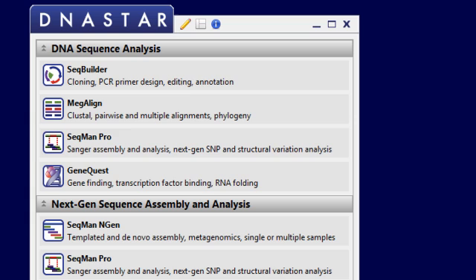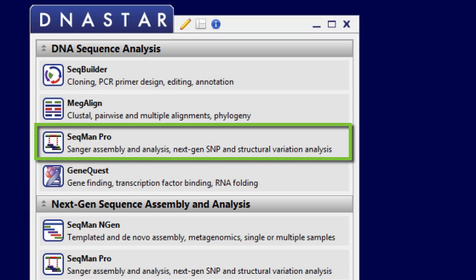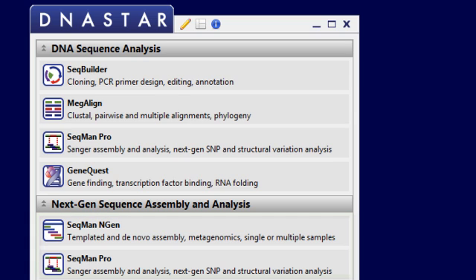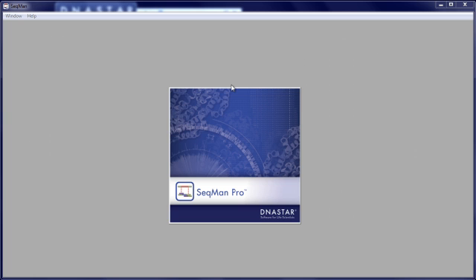SeqMan Pro is DNA Star's application for assembling and analyzing sequencing data. SeqMan Pro can be used to analyze next-gen assemblies from SeqMan Engine, but in this video, I'm going to focus on traditional Sanger sequence assembly and analysis using SeqMan Pro.